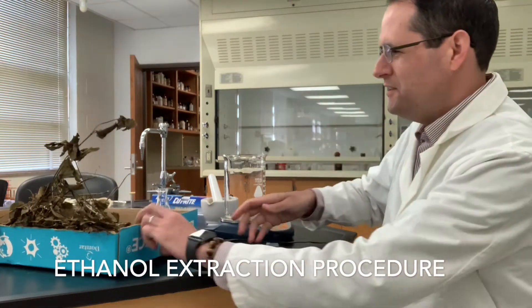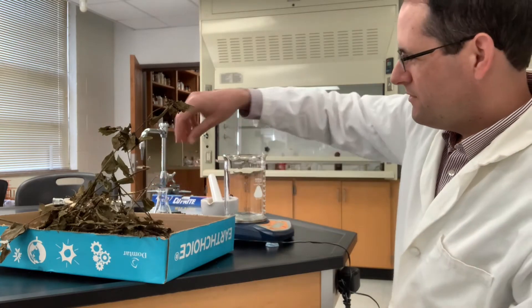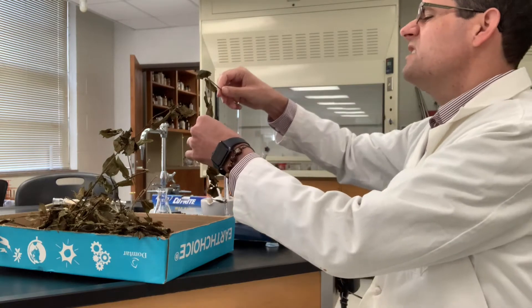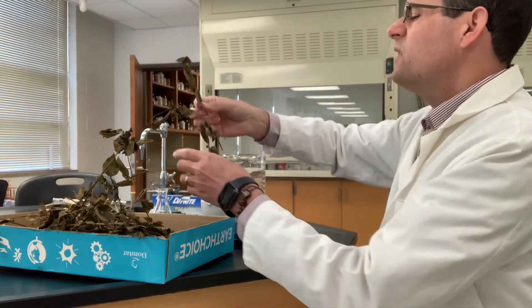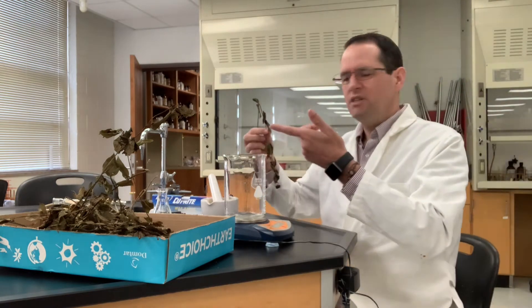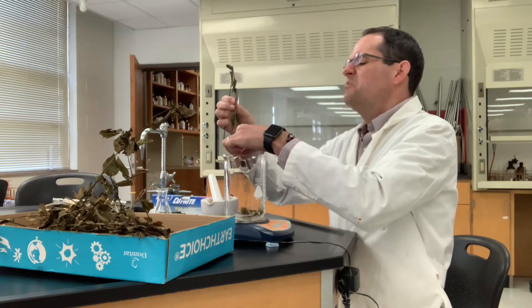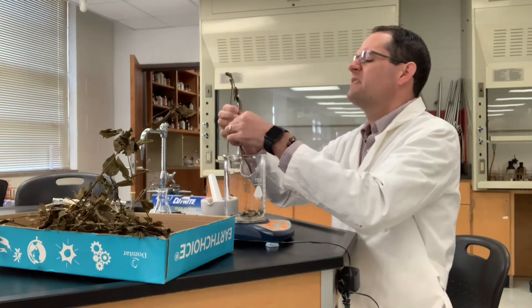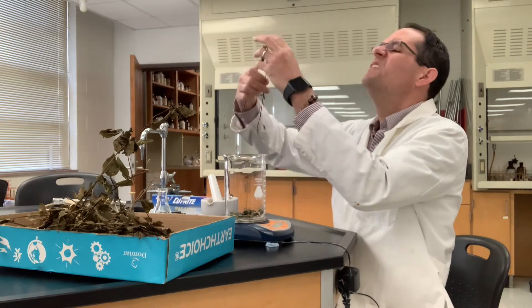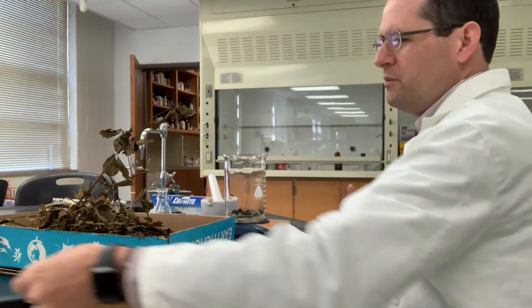The first step is to measure out 10 grams of dried leaves. These have sufficiently dried for a long time, and the balance is tared out with a very large beaker. We'll just put the leaves in there. They are very brittle, and we don't need the stems or the roots — so we're just doing the leaves.